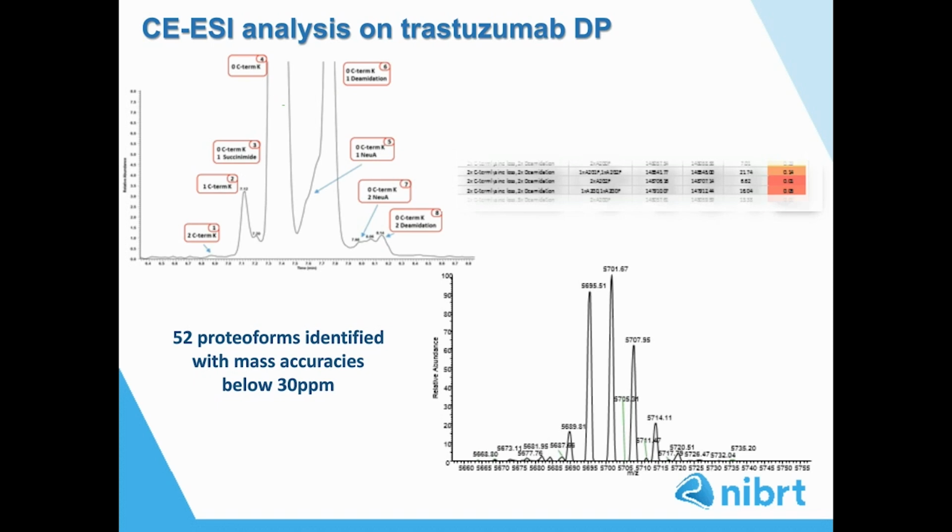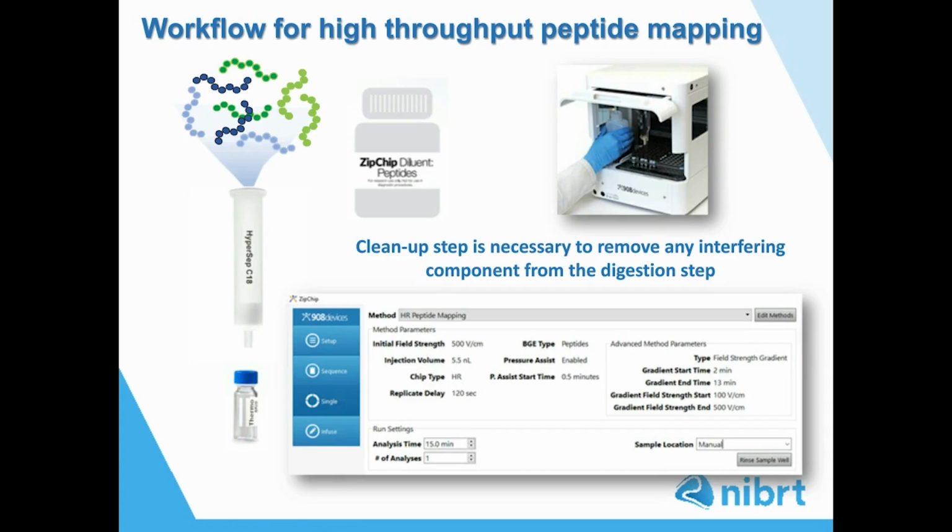The second workflow that we implemented on the CE-MS platform is peptide mapping analysis. And this analysis is considered a gold standard in biopharmaceutical and protein characterization, as it allows to monitor several attributes in the same analysis, and is considered orthogonal to many techniques.